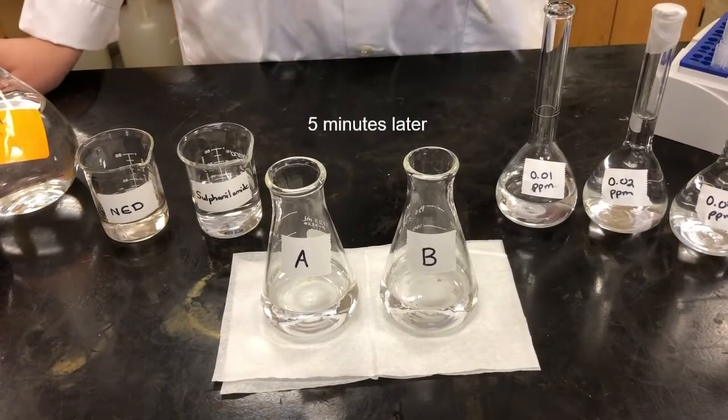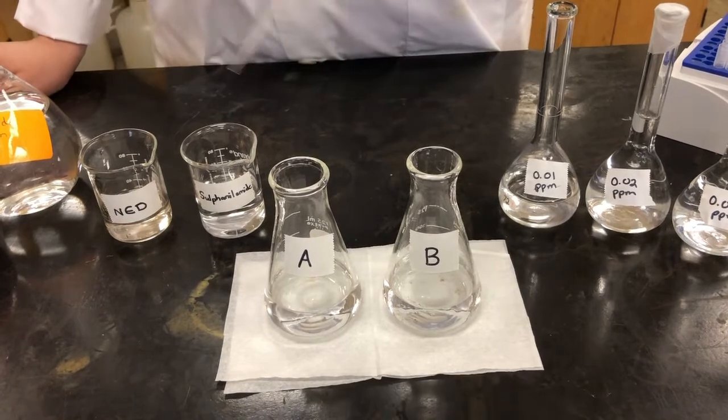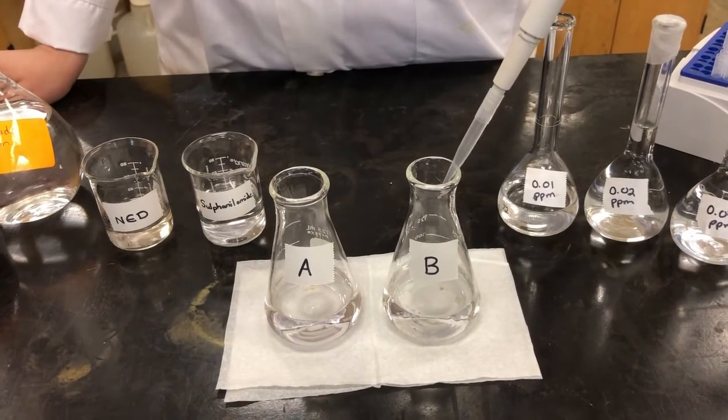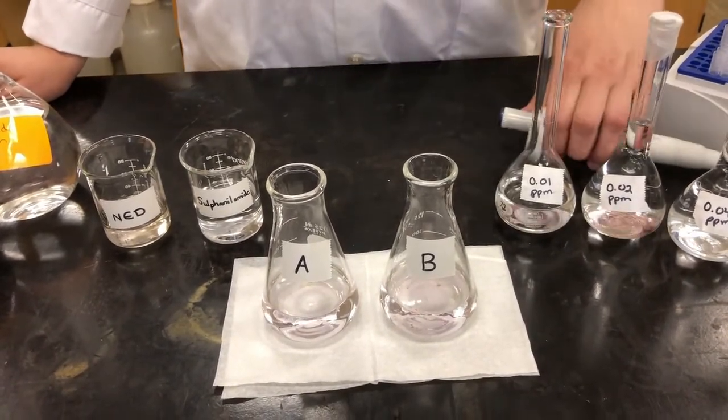Okay, so now we're ready to add the NED reagent. So 1 milliliter of NED to each sample. And again, we wait for 10 minutes for color development.